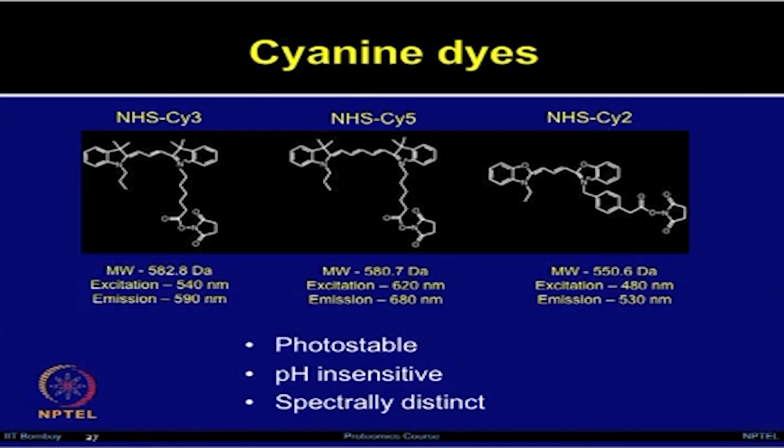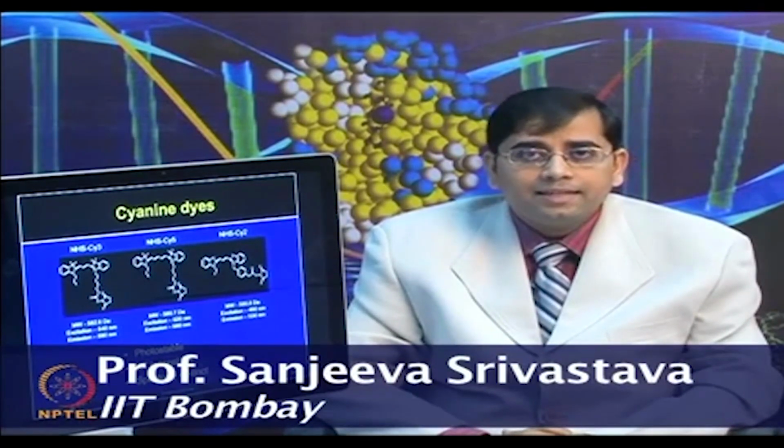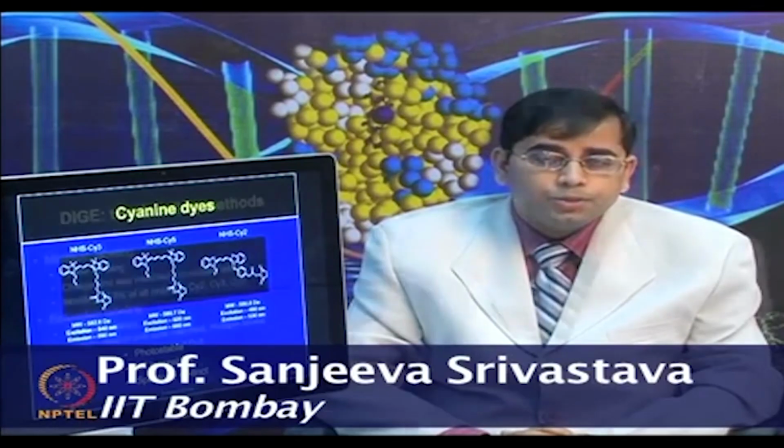The Cy3 excitation wavelength is at 540 nanometers, emission wavelength at 590 nanometers. The Cy5 excitation is at 620 nanometers and emission at 680 nanometers. The Cy2 excitation is at 480 nanometers and emission at 530 nanometers. So, these dyes are photostable, they are pH insensitive and spectrally distinct. By using these dyes, this DIGE method can be used.